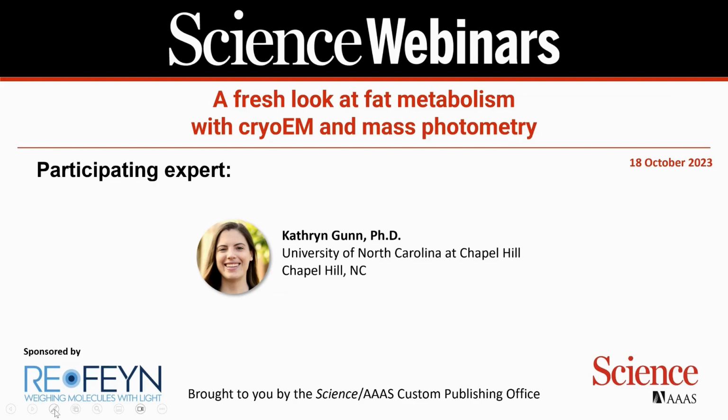Understanding the structural and functional aspects of LPL is crucial, given its significant role in lipid metabolism and related diseases. In this webinar, the speaker will describe experiments that uncovered how LPL interacts with its triglyceride substrate and what governs its oligomeric states.